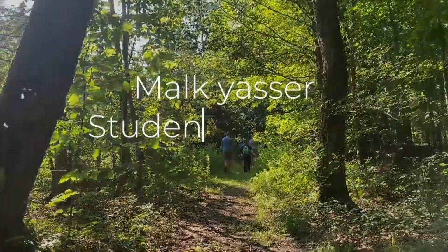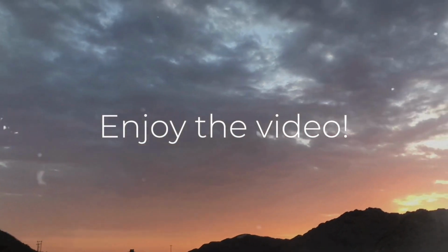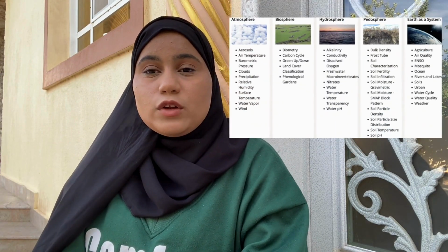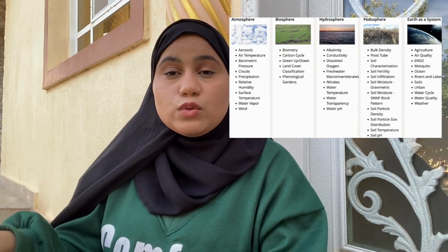Today in this video we will be talking about different protocols and we will get to see how we can use these protocols. So yeah, it's going to be exciting, so let's get started. Okay, we are settled down, ready to get our information down and talk about some different protocols. I'm so excited. First of all, before we start, you have to know that there are so many different protocols that we can use.